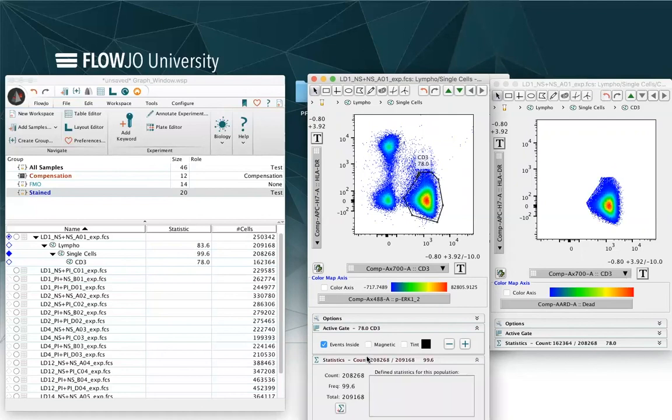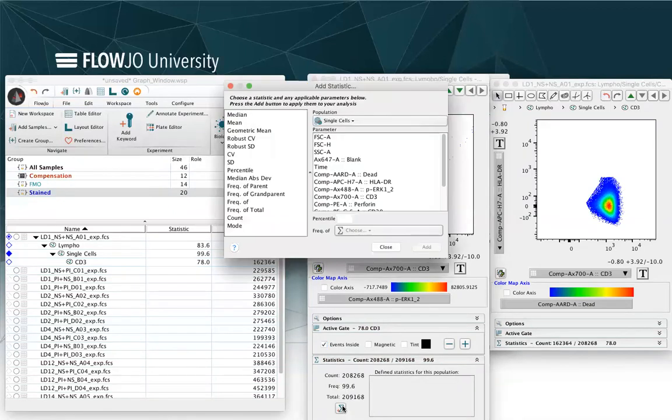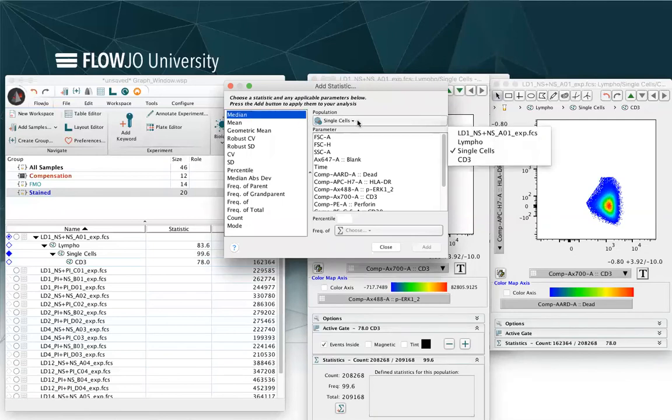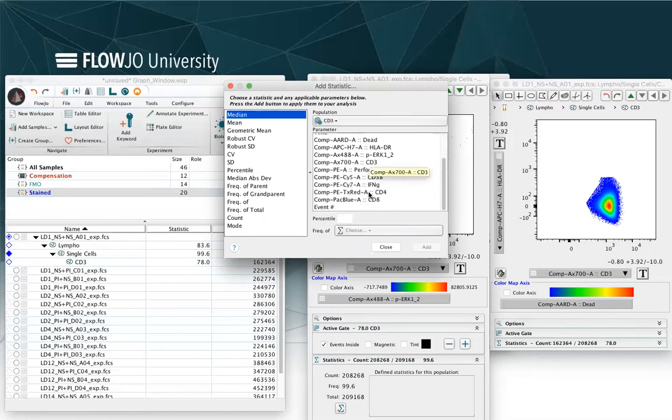In the statistic tab, I can select and choose to add statistics, for example, so I can click on the statistic sign and decide to add, for example, a median within a specific population of a specific marker.